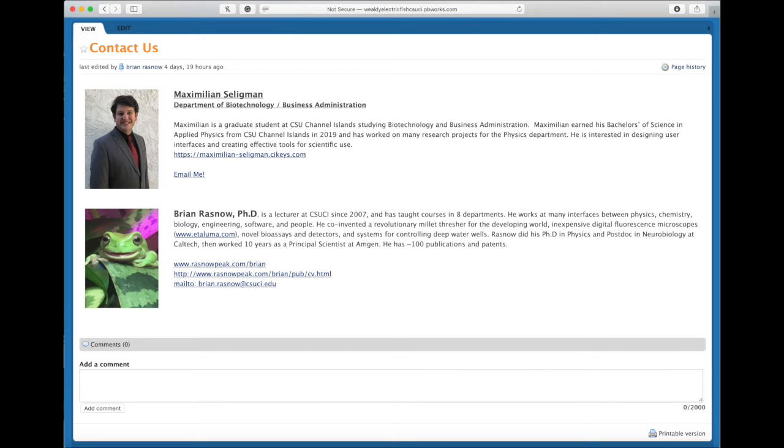In conclusion, we have created a versatile program that allows a valuable piece of scientific equipment to become more powerful while still maintaining its value to science. With our program, the LumaScope is able to image in bright field as well as three-color fluorescence in real time. It is also able to be completely customized as needed by the user and has endless applications to contribute to.